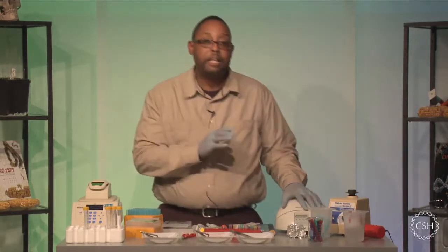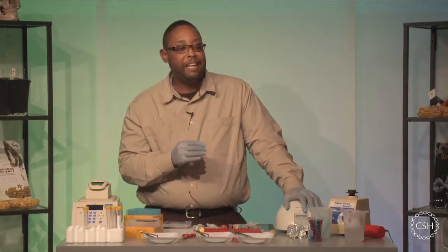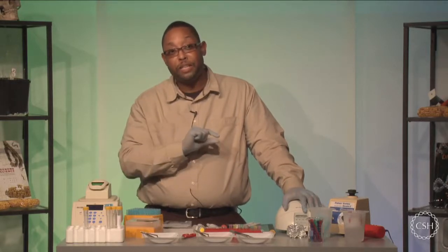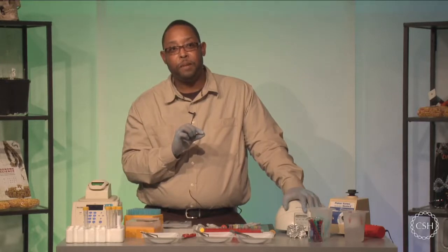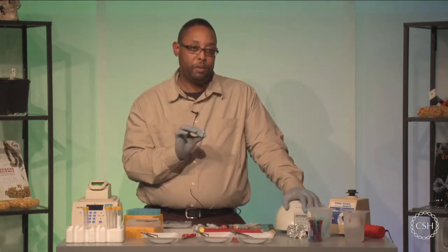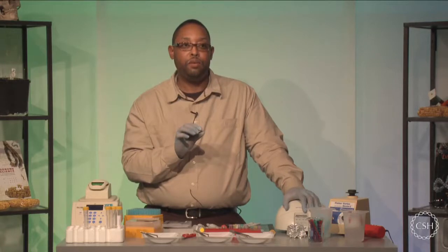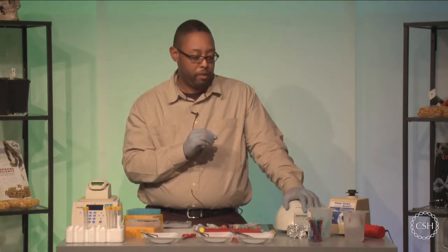Okay. This last spin is going to ensure that our pellet is back down at the bottom of the test tube. And at this point, we're going to try and make sure that when we take off the supernatant or the wash buffer in this final wash step, it's completely off. We're going to make sure that it's as dry as it possibly can get. Now, we don't want to let the pellet dry too long. I would not let this dry more than about 2 to 3 minutes max, to ensure that you don't over dry the pellet and don't allow for DNA to be fully eluted off of the resin.